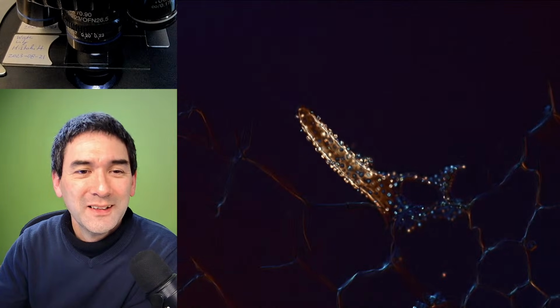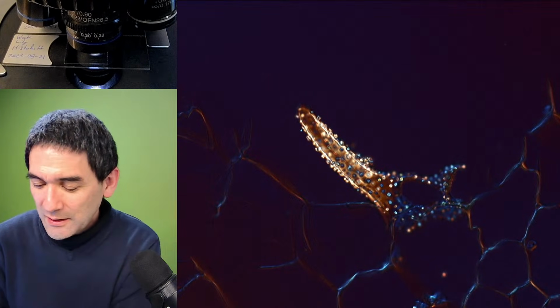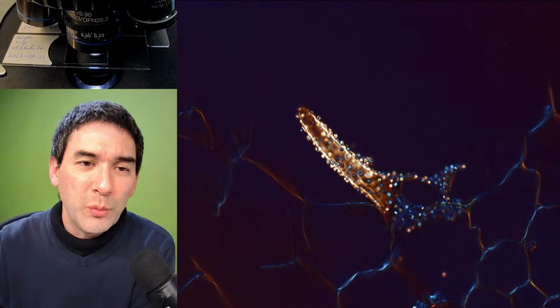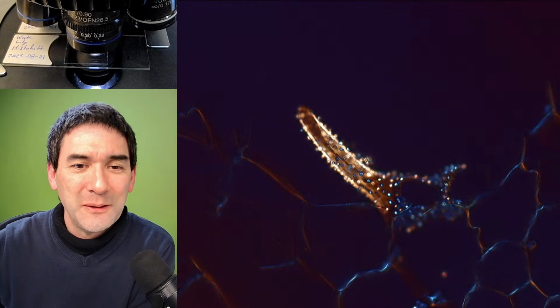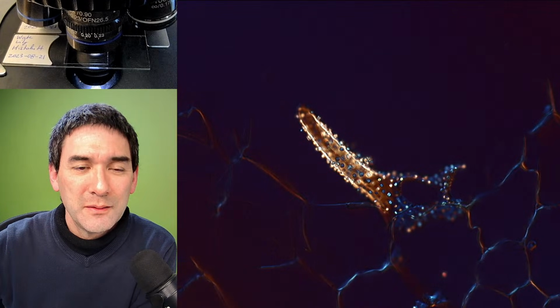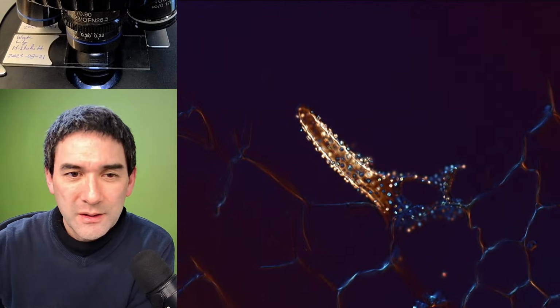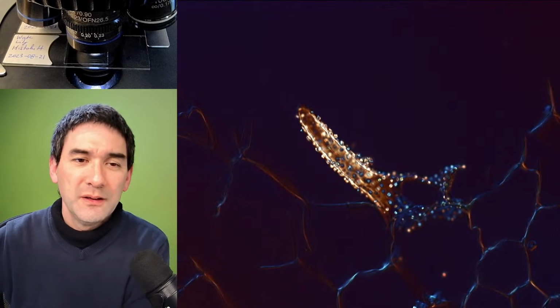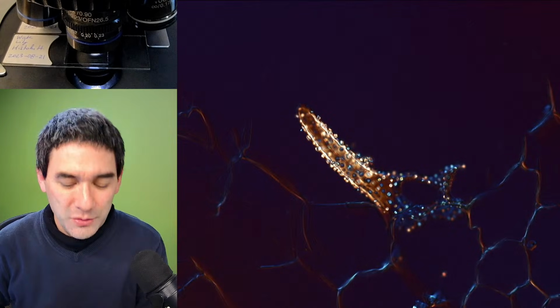Nice looking. Yeah, again, these are crystals, and the cells that form them inside the water lily are called idioblasts for whatever reason. So idio means different. So these are cells that are kind of different. And that's also something that I just wanted to show you here.